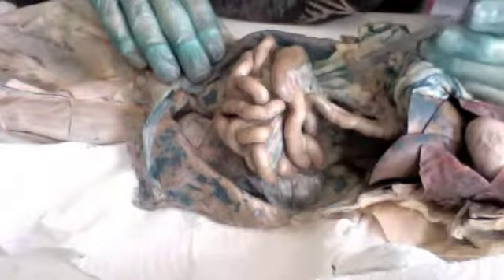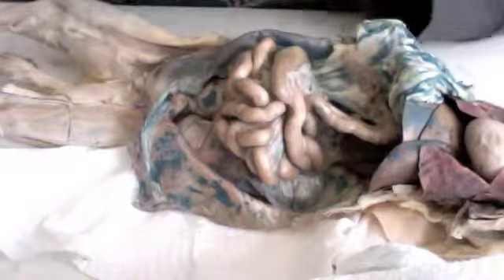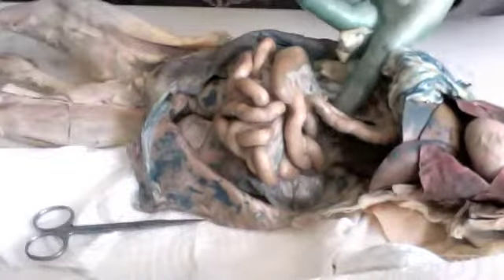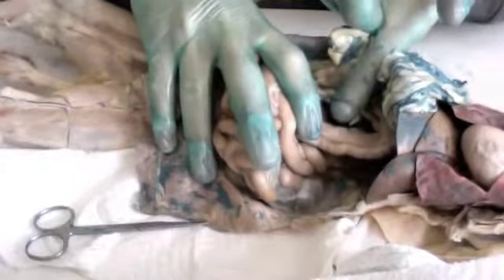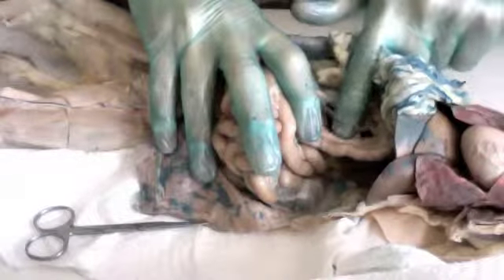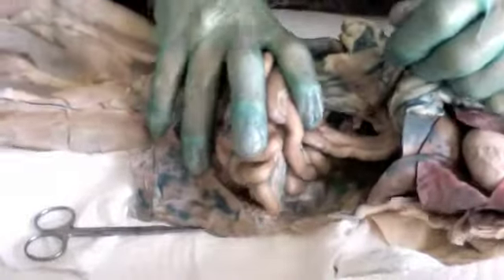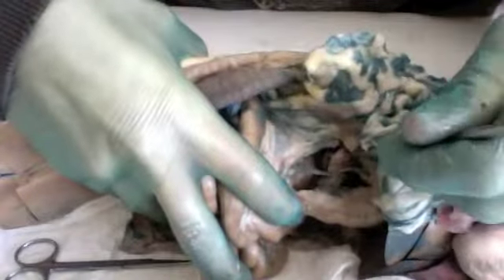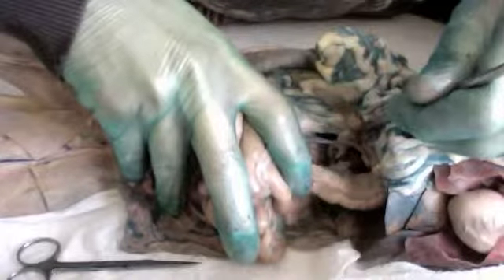Okay, I'm going to try and display the portal system now. The first thing in the portal system that I'm going to display is the superior mesenteric vein. This is the superior mesenteric vein, and then the gastrosplenic vein branches directly off of that. I couldn't get that much of it, but it's still visible. So this is the gastrosplenic vein. The gastrosplenic vein branches off of the hepatic portal vein, which is here.